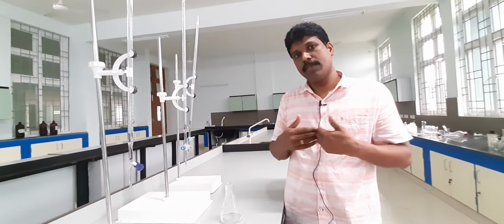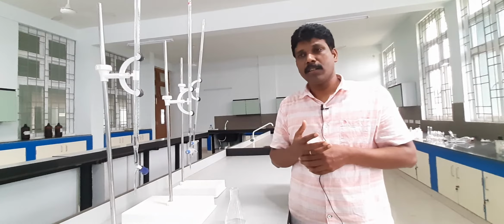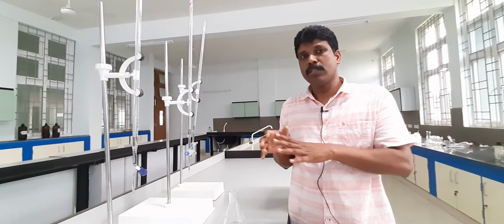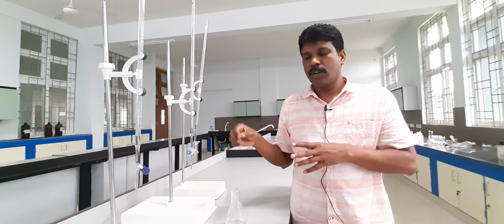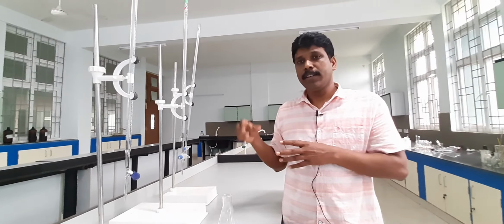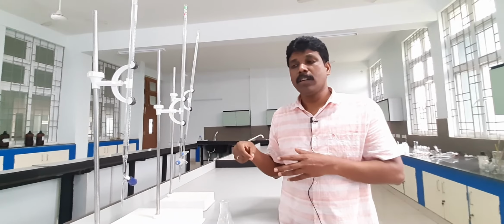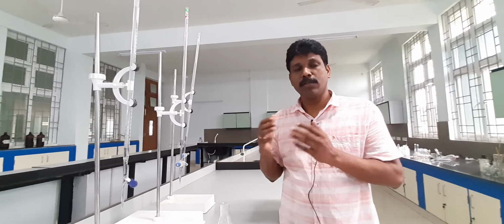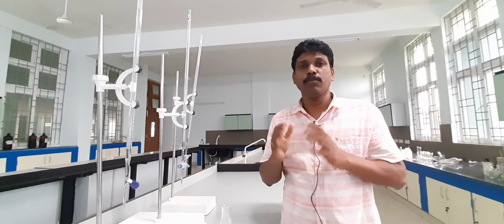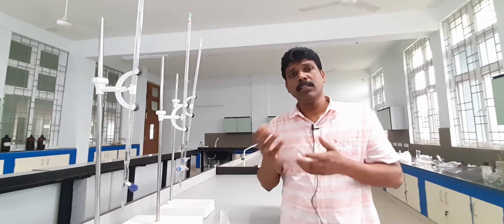Like that you have to have some variation, approximately 12 or 13 variations. With each conical flask holding one of these compositions, one by one you titrate them with water and estimate how much water is required for each composition of acetic acid and chloroform. You measure the burette readings and record them in the rough notebook.